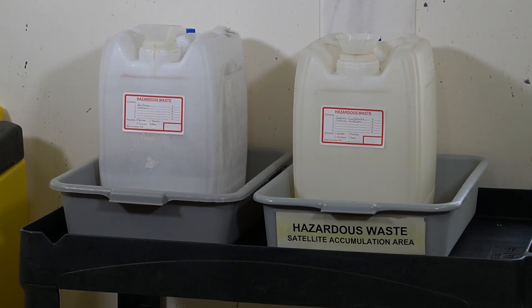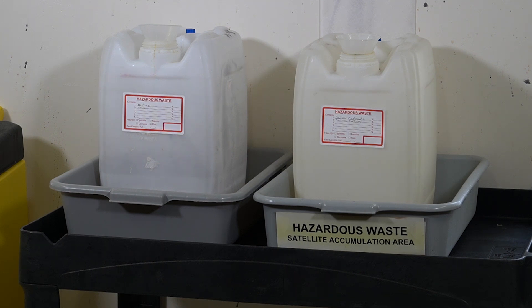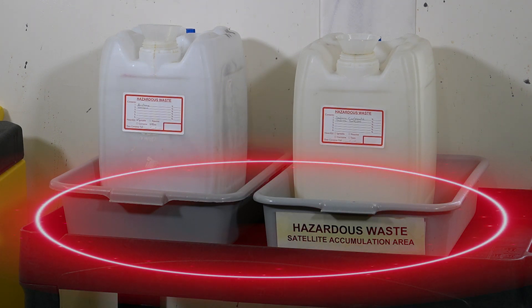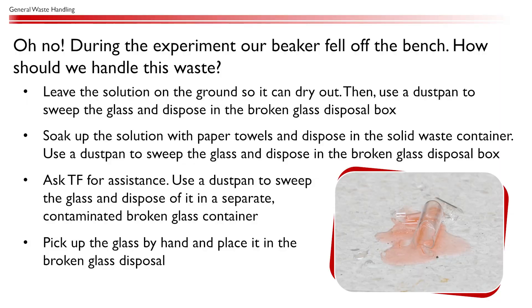Liquid waste bins host all the solution waste we produce during lab work, and these bins are typically kept in a designated waste satellite accumulation area in the lab. Oh no! During the experiment, our beaker fell off the bench. How should we handle this waste?